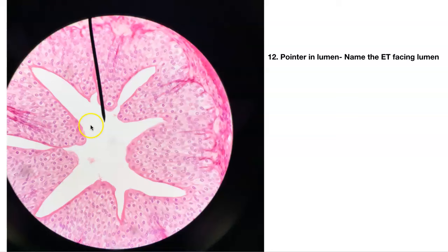Number twelve — pointer in the lumen. What's this epithelial tissue? Here's the epithelial tissue, basement membrane somewhere around here. It's stratified — but look at the top layer: weird dome-looking cells. This is transitional.